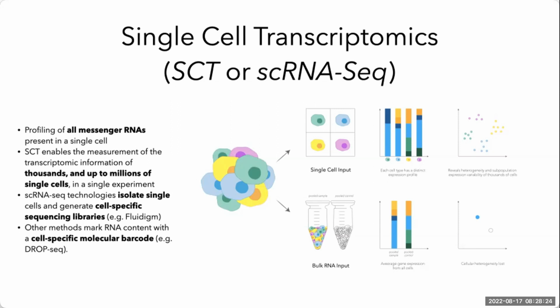We lose cell differentiation information, we lose cell heterogeneity information, and we do not consider eliminating cells whose expression data is an outlier compared to the bulk transcriptomics pattern.